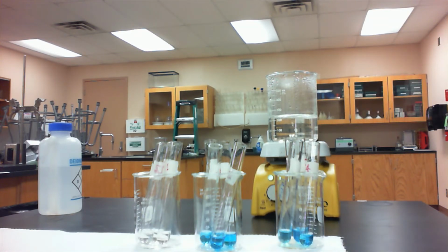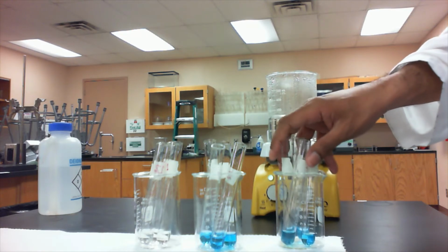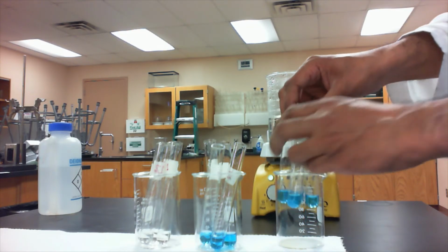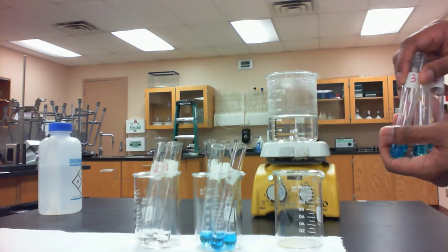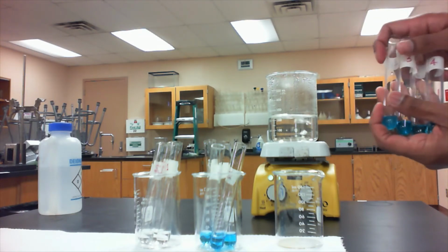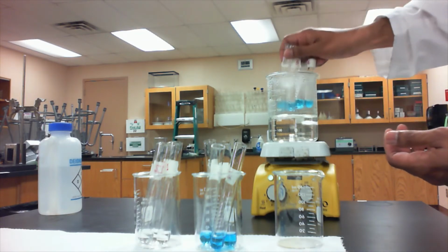So what you probably would have noticed in the background is here I have my boiling water bath set up. So this is just a beaker with about 250 mils of tap water, and it has a nice rolling boil going on. So I'm next going to place test tubes 1 through 6 into my boiling water bath, and I'm going to let it sit there for about 5 minutes, and then I'll take a look. I'll remove it after 5 minutes and let it cool down and take a look at any color changes that have occurred.